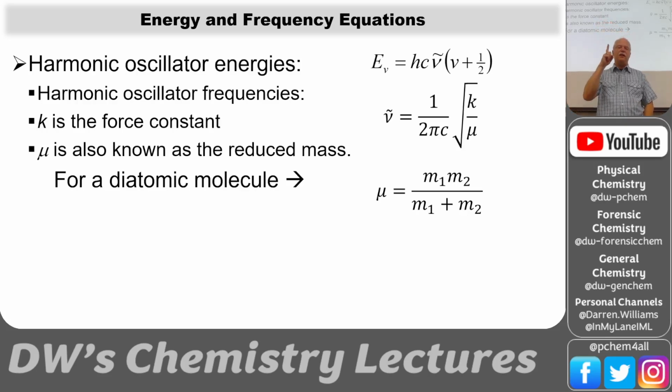As the force constant goes up, so does the vibrational frequency. But as the mass goes up, the vibrational frequency goes down because it's in the denominator. And it's a square root dependence. So there are some homework problems associated with that.